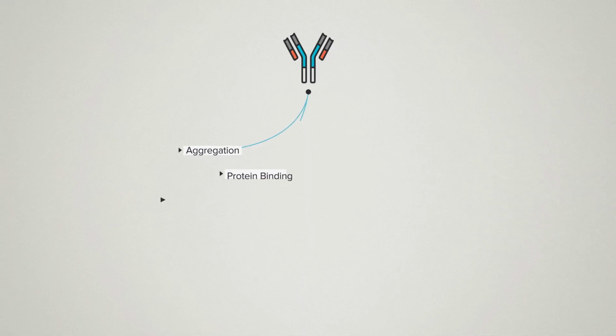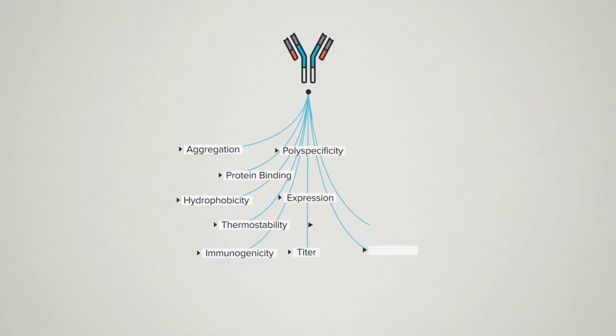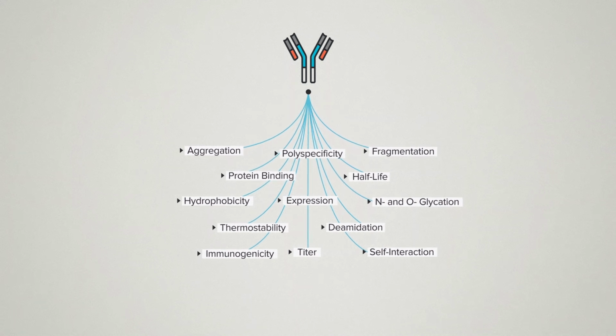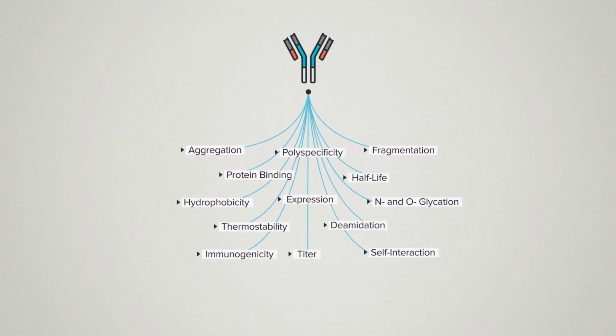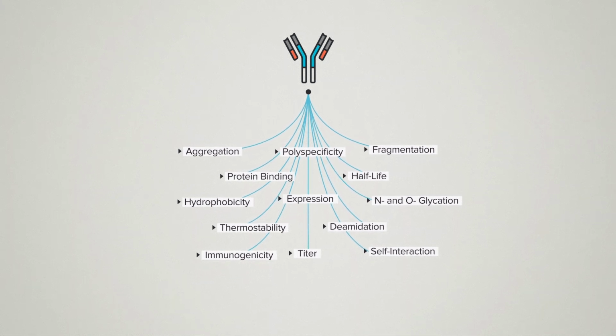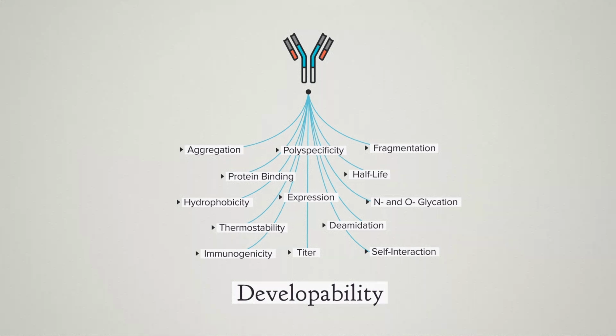A good antibody drug needs to be specific, to be stable, to express well during manufacturing, and so on. A whole set of other tests meant to de-risk clinical translation that are sometimes called developability assays. I'm using this example not just because Ginkgo offers antibody developability services, although we do, so, call me. But to show a concrete example of the many operations of an R&D project.